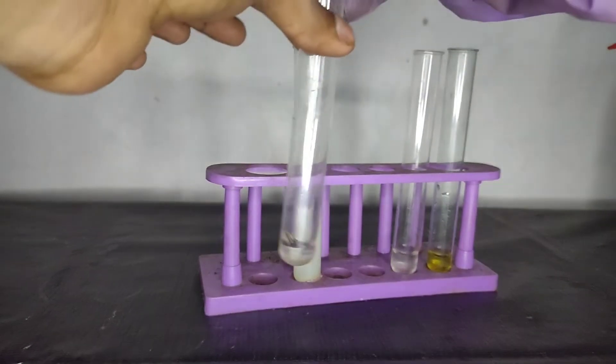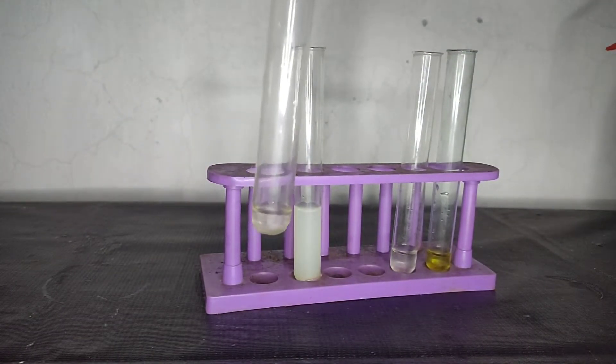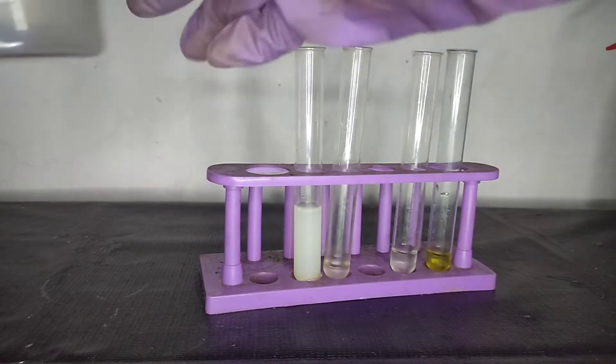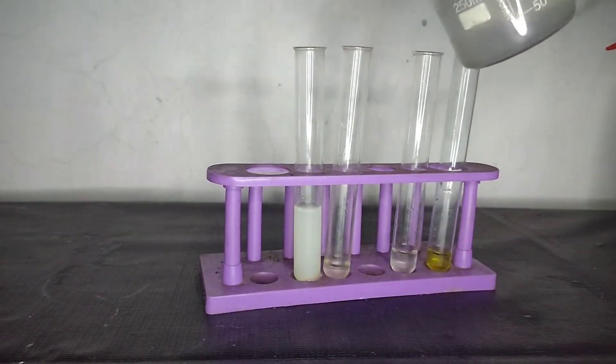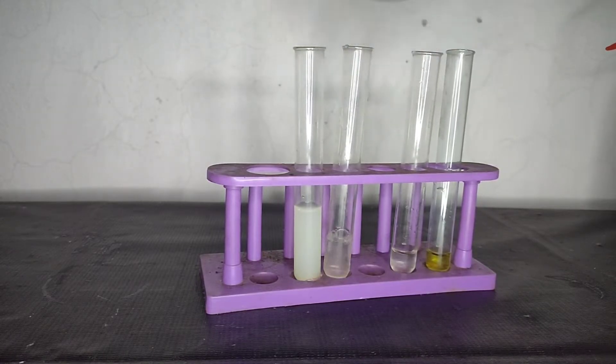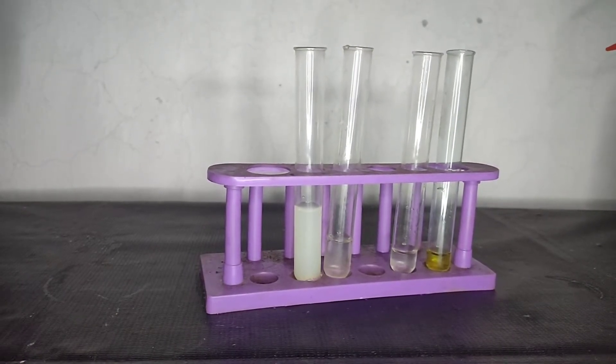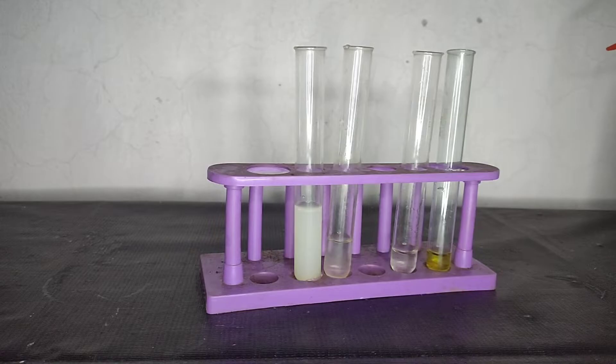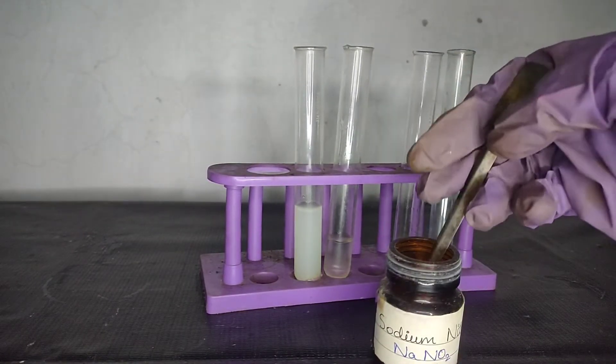Take some amount of soda extract. To this, add some starch solution. So over here, I have some starch solution. Now to this, add sodium nitrite. So over here, I am adding some sodium nitrite into it.